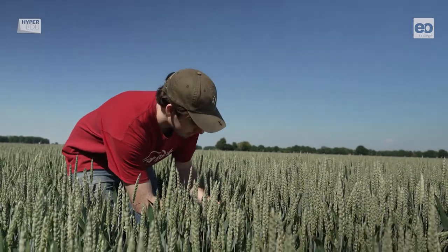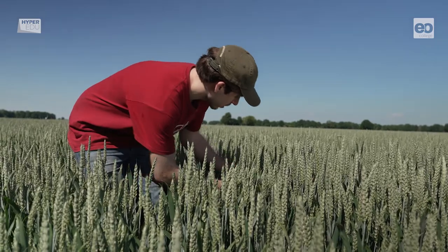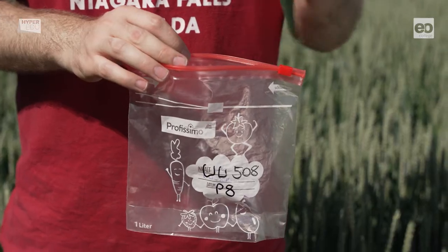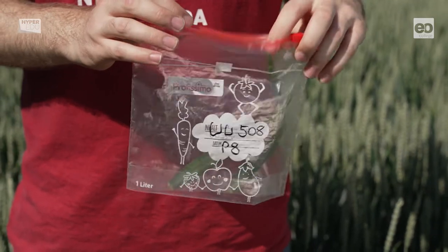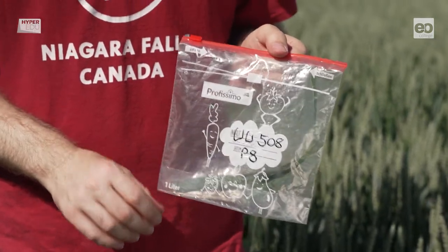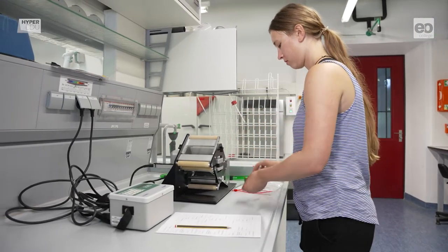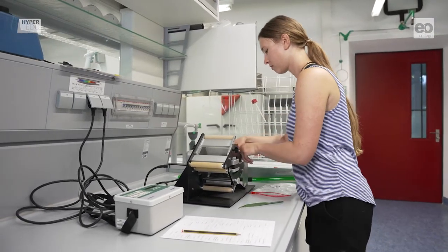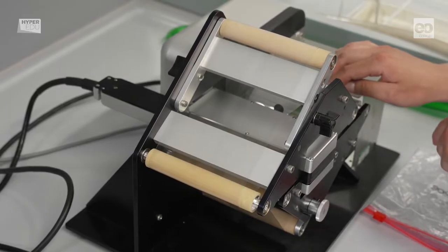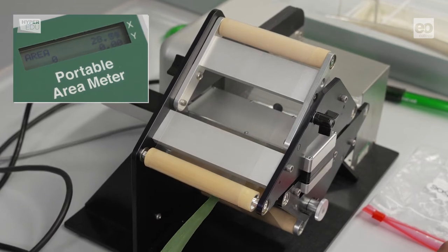After a number of non-destructive measurements, Marco harvests a couple of leaves to assess leaf mass area, or LMA for short. This is an important variable as it indicates how much biomass the plant invests in the development of leaf area. Now you can see Stephanie in the lab measuring the leaf area with a special instrument, the portable area meter. The leaf that Marco sampled has an area of 29.01 cm².